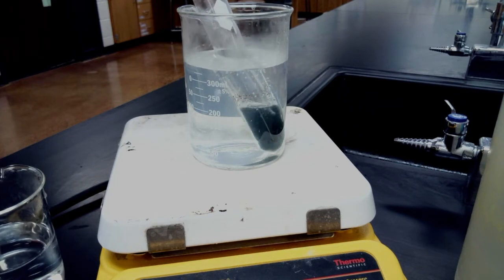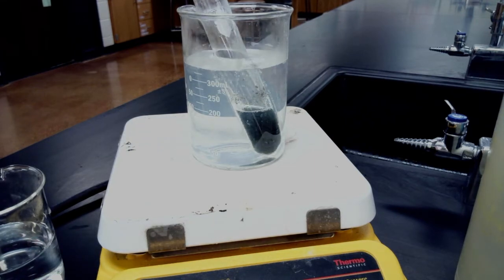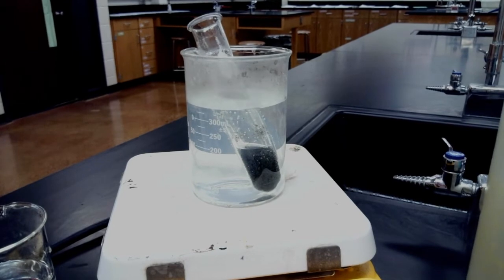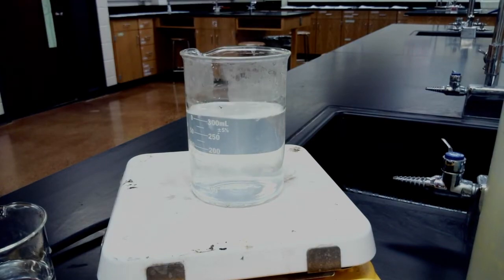And then when this is done, it'll get moved to a cold water bath that you can see to the left. Then you let it settle so that we can observe the solid and the liquid part. We already can see that the solid is black, but we've got to let it settle so that we can see what the liquid looks like. That is a test tube holder used to move that.